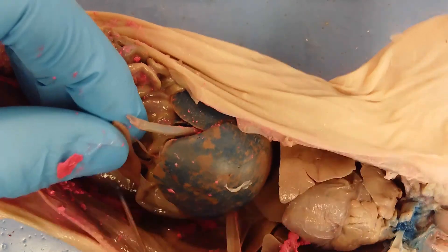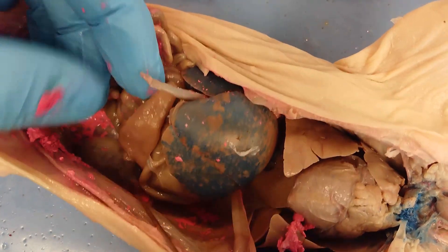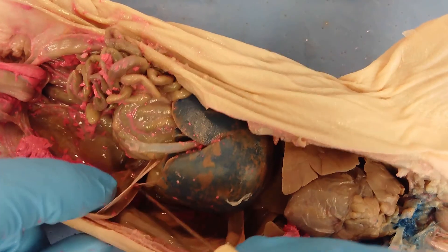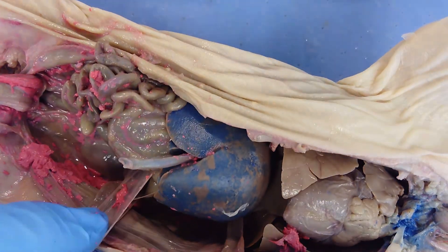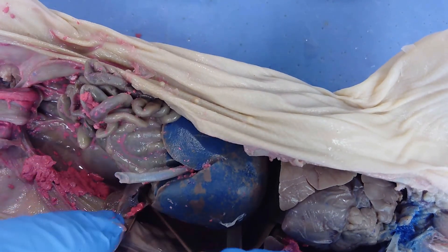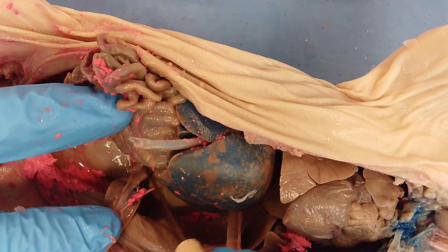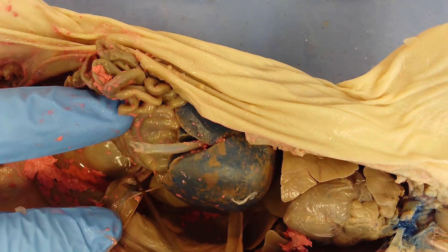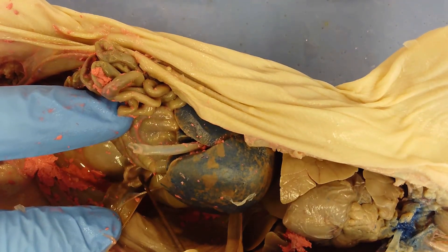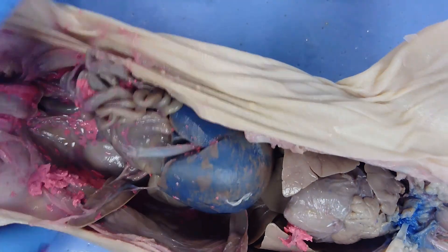Other visible structures include this triangular structure, which is the spleen — it filters blood. On the underside of the spleen is the pancreas, which is fairly well-developed in this pig with a different texture.